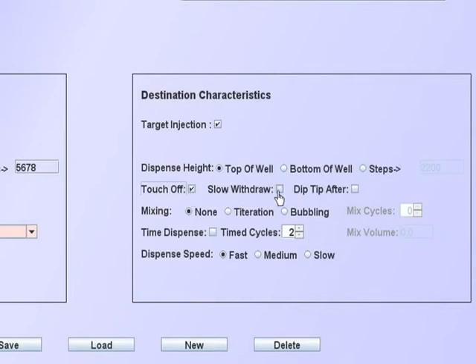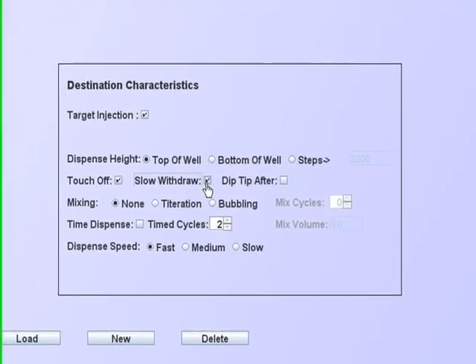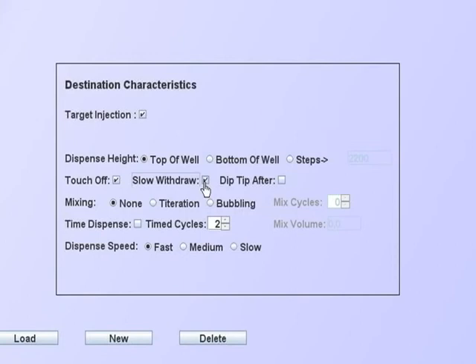The slow withdrawal is useful to wipe the tip exterior as it leaves a liquid surface. If a significant volume is to be dispensed, it can be dispensed at the bottom of the well. The dispensed liquid will surround the tip. A slow withdrawal would assist in wiping the tip surface of clinging drops.